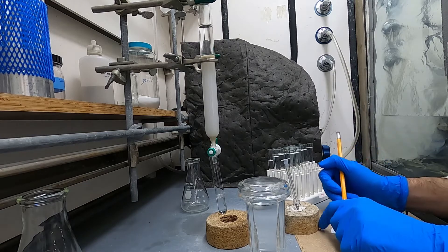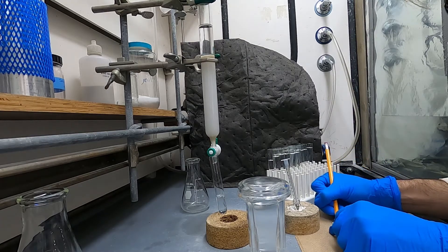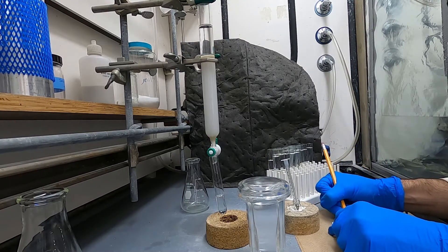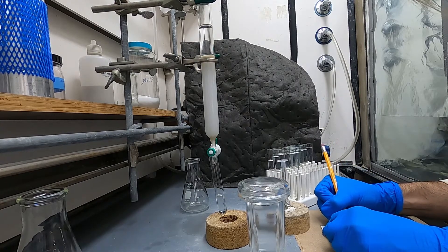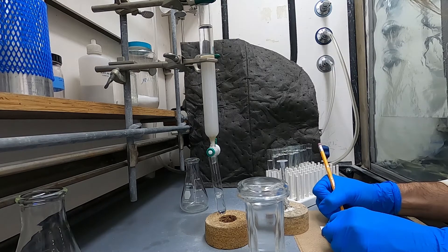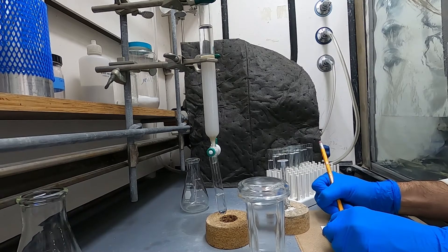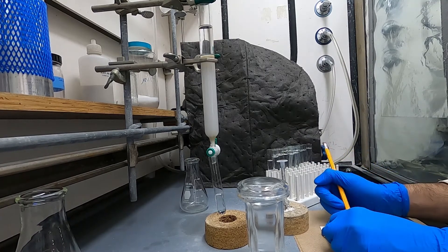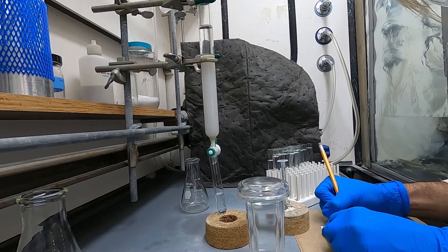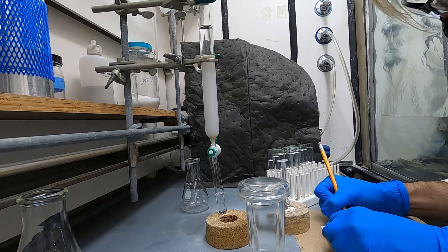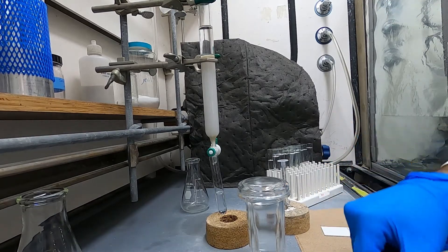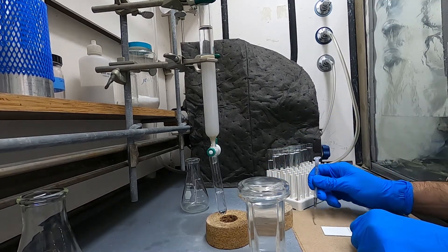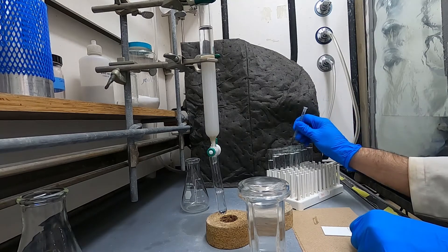Once you've collected your fractions you'll want to spot them on a TLC plate. So I did not have it pre-marked so I'm going to mark it now. I think that my material should come out probably starting in like the seventh or eighth fraction just based on the amount of silica that I used and the RF in the solvent system that I used.